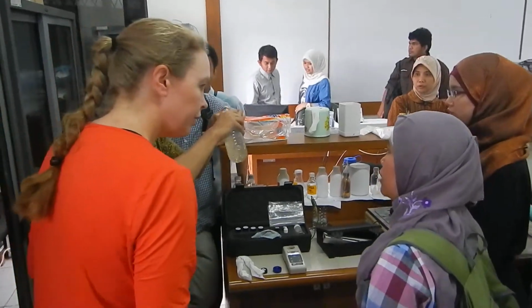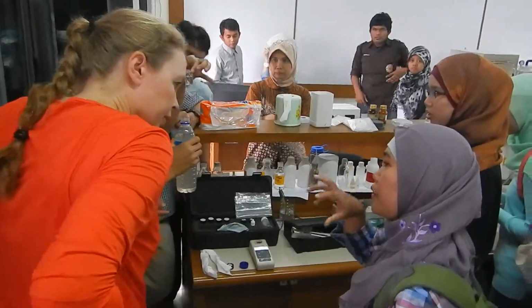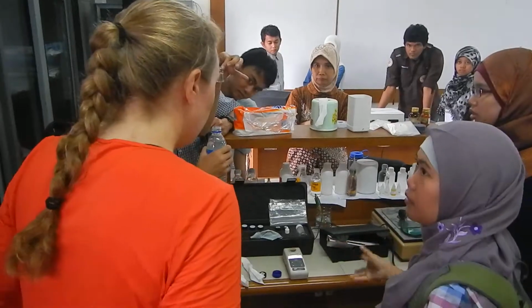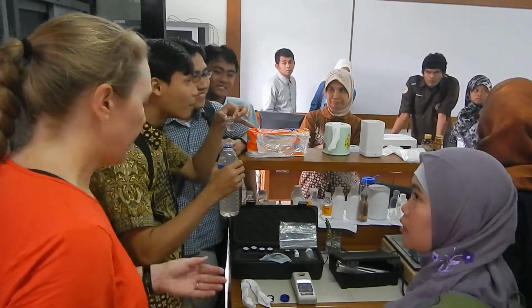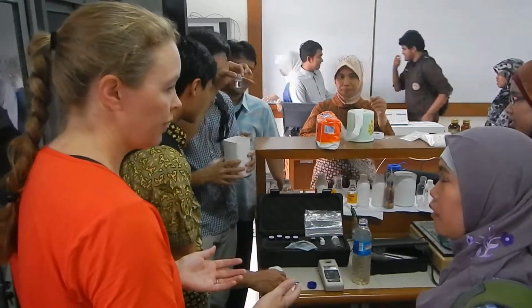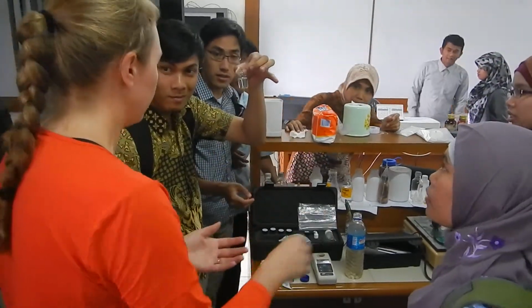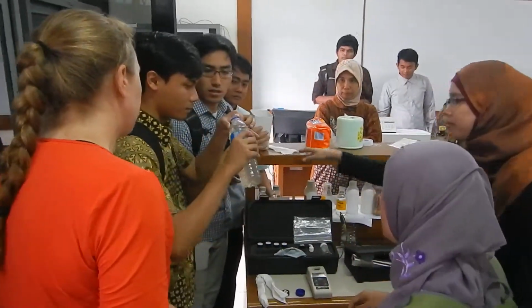When we use some portable equipment, we always calibrate in every place we measure. So, like the turbidity meter, if you're using a portable, you should be fine if you're doing it all within one day. But calibration on these things usually takes just like a minute. And so in my lab, we just calibrate it every time. Because it's not like a long calibration process. It's just put it in, go a little bit above the white line. We have plenty of sample. Don't worry about wasting it.